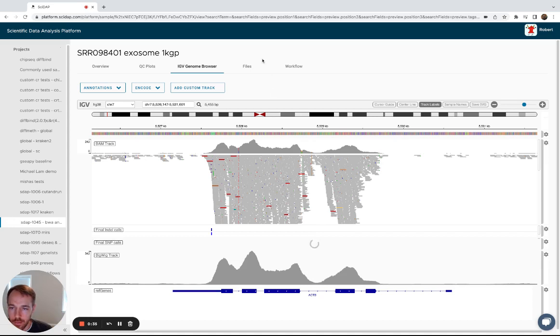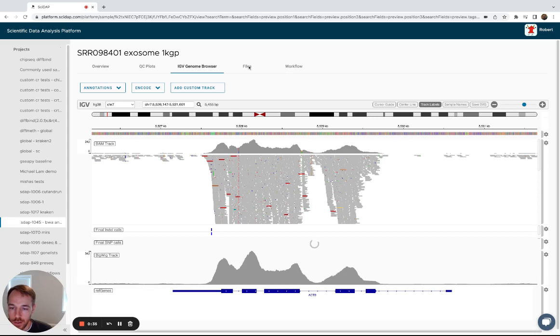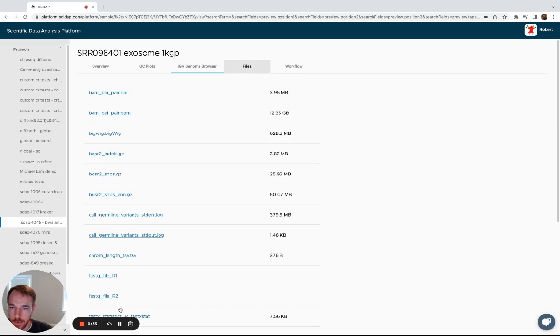And then we also have this final files tab, which contains intermediate files that you can download after the fact. And that's it for the germline variant calling workflow. Thanks.